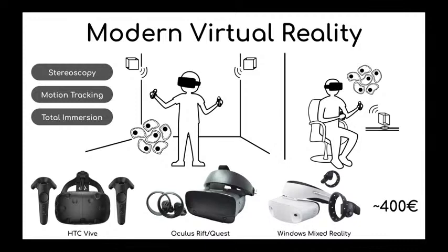It involves wearing a specialized headset that makes full use of stereoscopy, but also combines precise positional tracking of the headset and handheld virtual reality controllers that can be thought of as 3D mice, essentially. Wearing the headset, the user is totally immersed and transported into an entirely artificial computer-generated environment that can be interacted with in 3D. Numerous commercial VR headsets are currently available at prices that render them easily accessible for scientific laboratories.